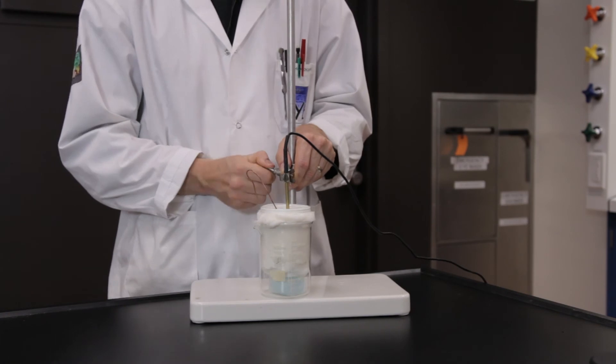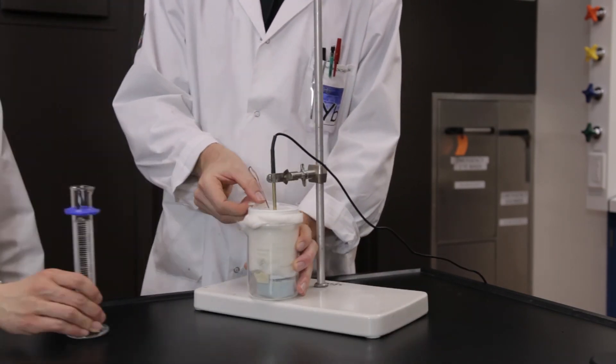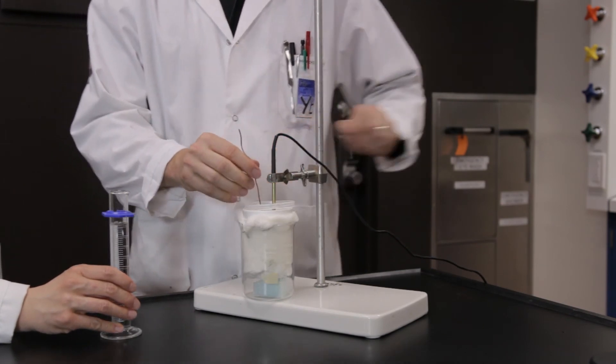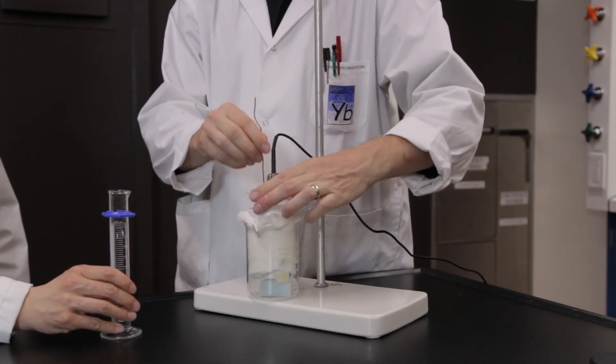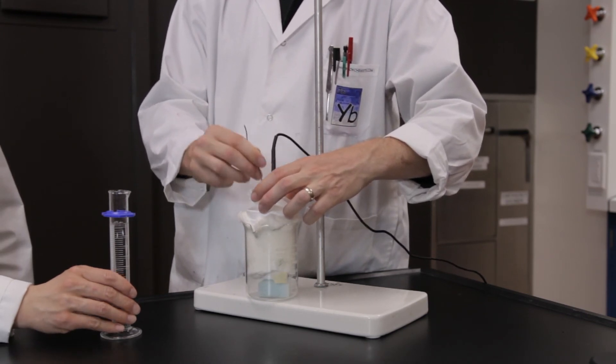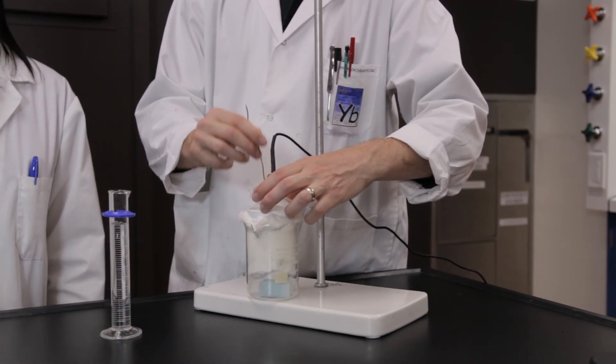The difference between the temperatures of the hydrochloric acid and sodium hydroxide solutions should not exceed 2 degrees Celsius. When you're ready to add the hydrochloric acid solution to the sodium hydroxide solution, make sure to collect data for 10 seconds of just the sodium hydroxide solution.